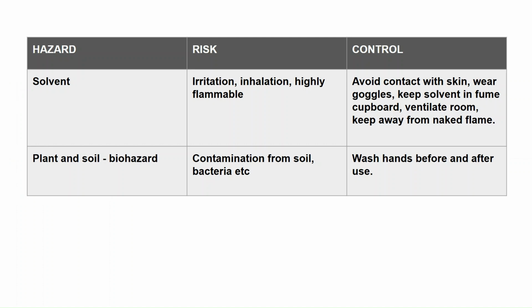Right, so just a quick risk assessment. It's pretty much common sense, but I thought I'd take you through it anyway. Your first hazard is the solvent that you use, both in the chromatography part and also grinding up your sample, because they're very, very flammable. And also, it can cause skin irritation and inhalation hazards as well.